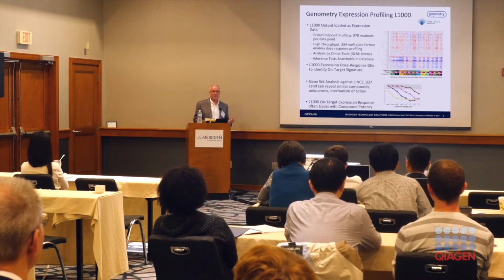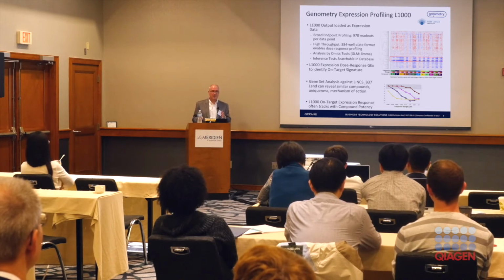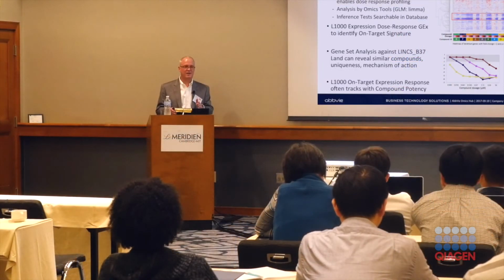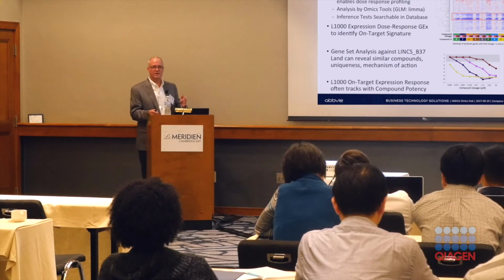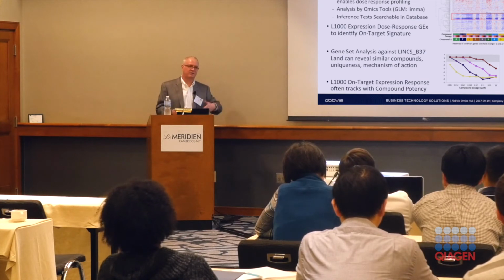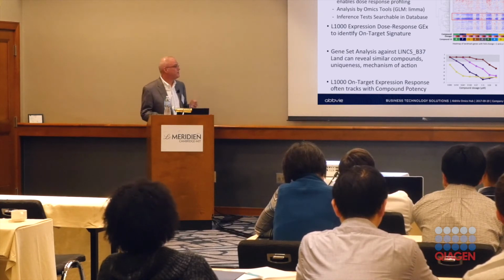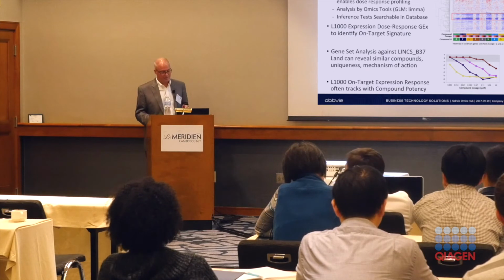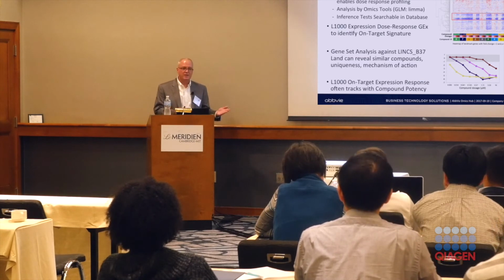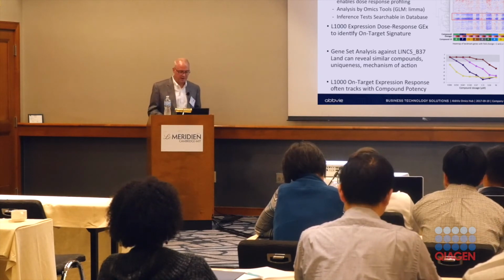And sometimes you can actually see, some compounds it's very pure. Some compounds that are off target, you'll see the dose response of your on target, and then you'll also see somewhere in the range some off-target thing kick up, as you've gone into the off target and it's toxic above that level. So that's been very helpful. A variety of teams have used that to understand mechanism of action or look at the uniqueness of various compounds in a series for a particular target.